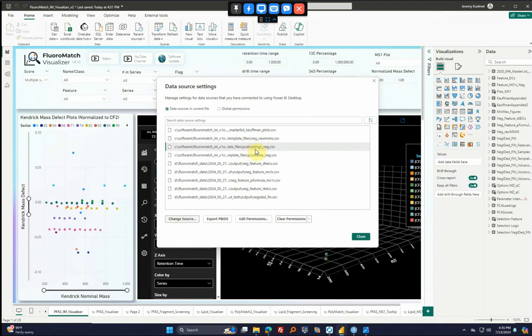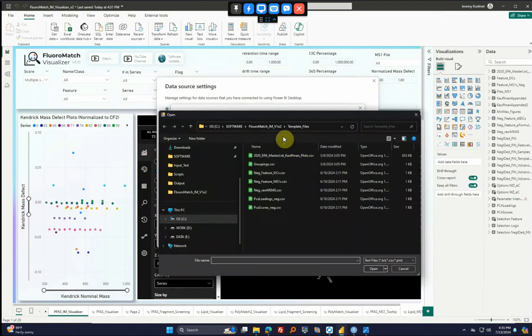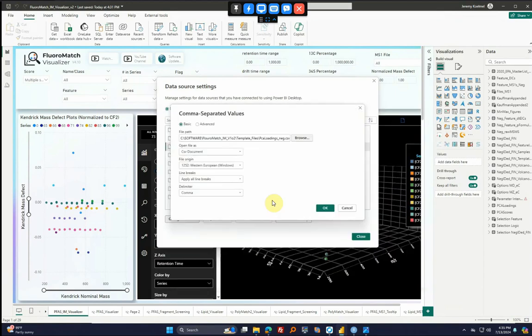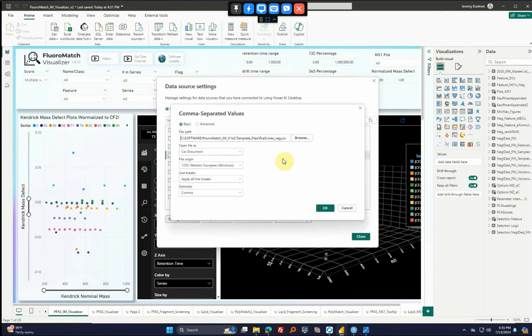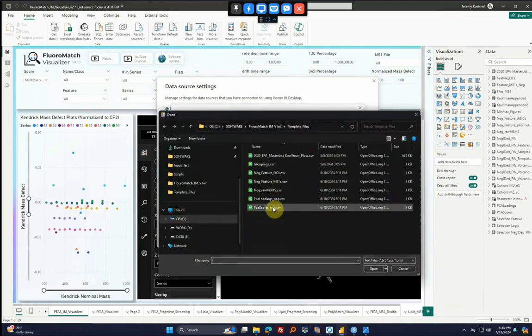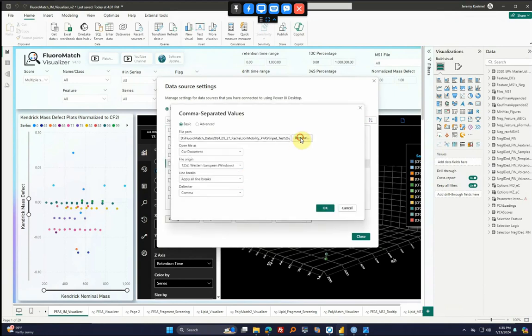So the PCA loadings _neb, just like all the other files, you look for the same name. So make sure to replace the same name and don't mess that one up. So let's go for the loadings. And the scores. So those are the template files, and now the remaining 5 files are going to be from your outputs. So make sure to grab those from your outputs.